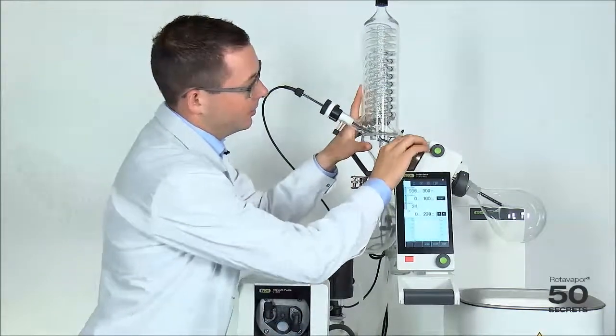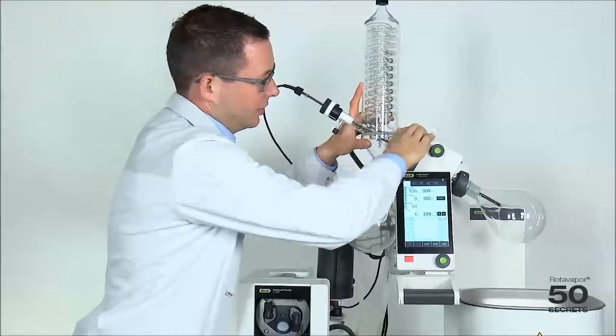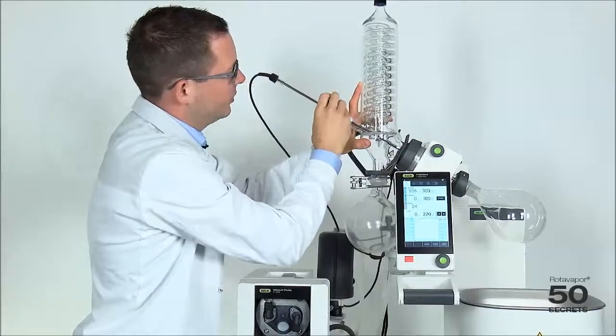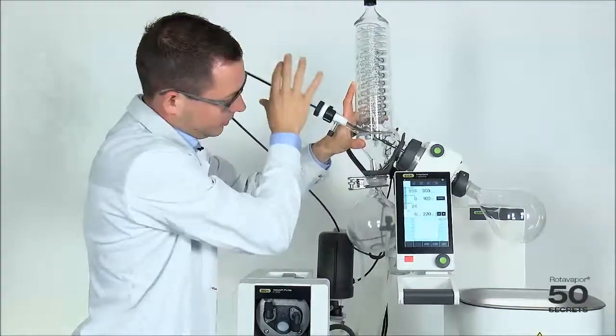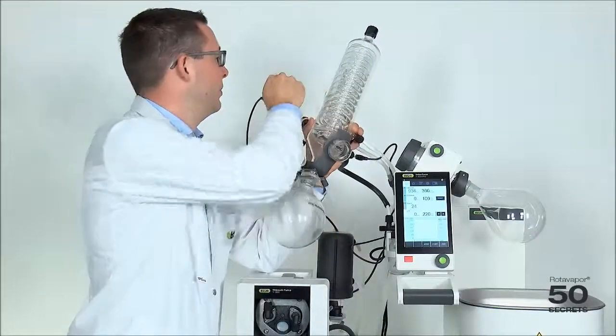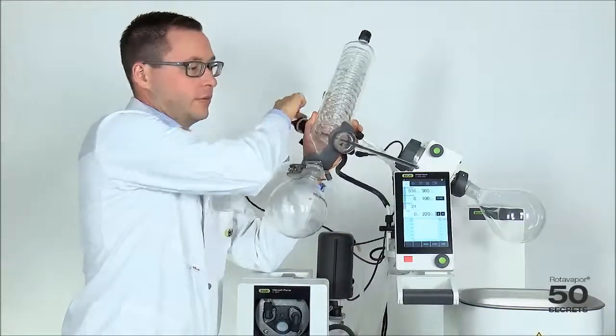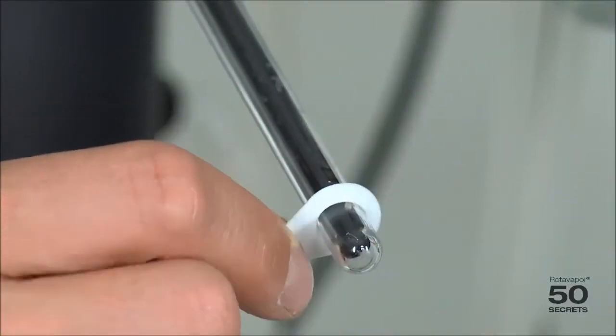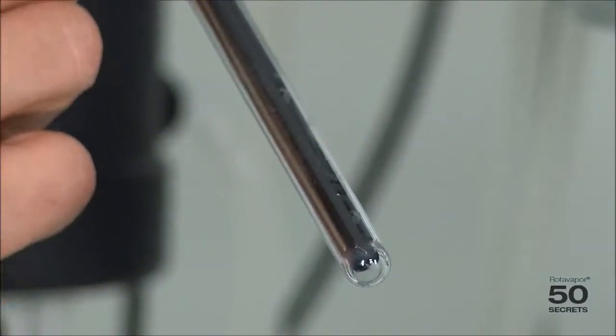First, we unscrew the condenser. We take out the foam sensor a little bit, we unscrew this, we take it a little bit out like this. Take the sealing off. We put the foam sensor back and we put the drain disc on top of the foam sensor like this.